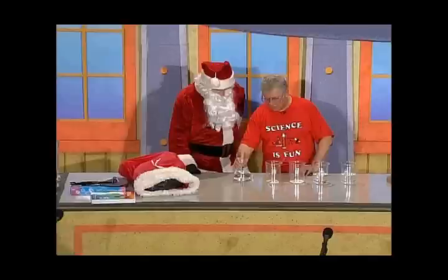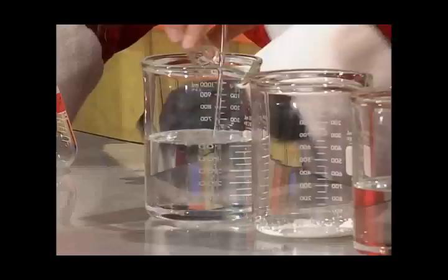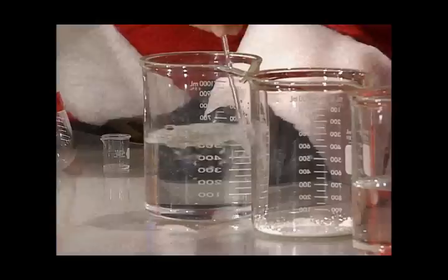All right, so what I want to do is take this clear and colorless liquid and put it in there, and I want to make this liquid turn blue. Blue, okay. I like that. That's really going to be dramatic. I'm going to add this other ingredient here and mix that. Oh, wait a minute. You said it was supposed to turn blue. I did say that, didn't I? You sure did.